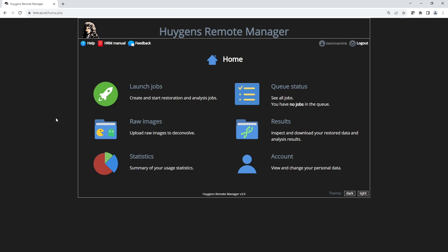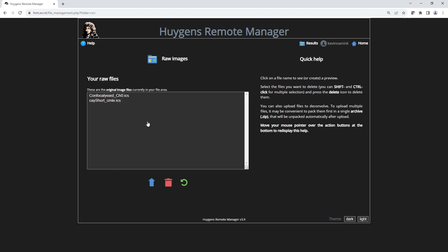On the HRM website, you first have to upload the images you want to process. Do so under the Raw Images option. This can take some time if you have very large files, but you can use Omero to transfer the files as well. This is currently only possible in the HRM.